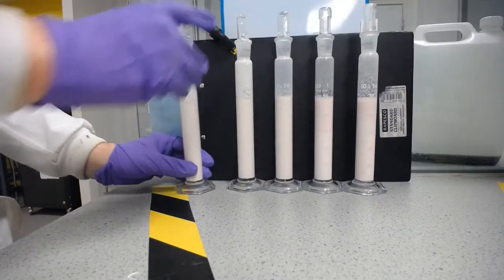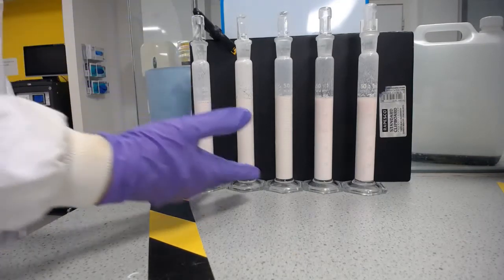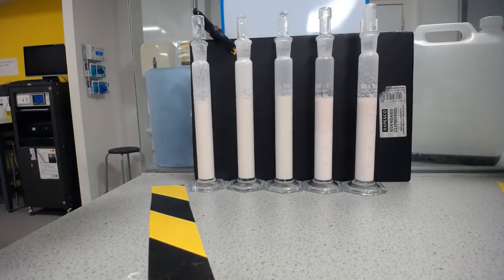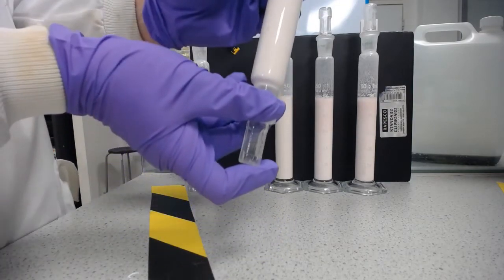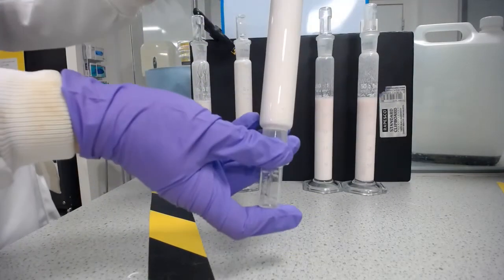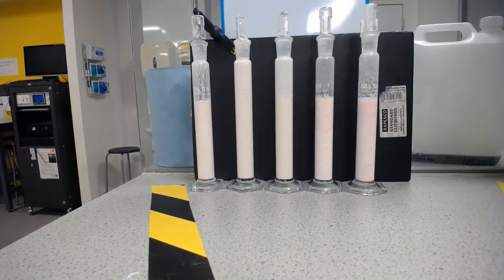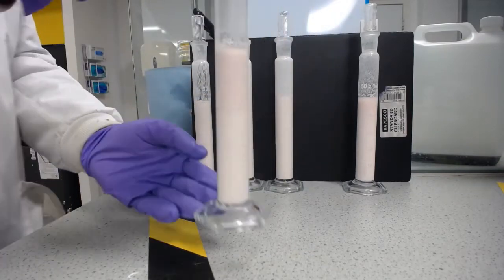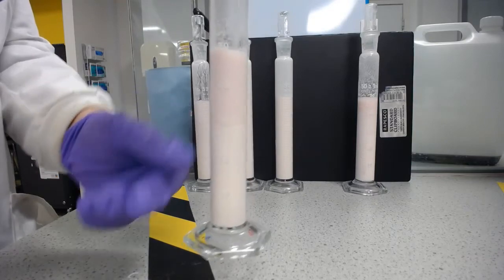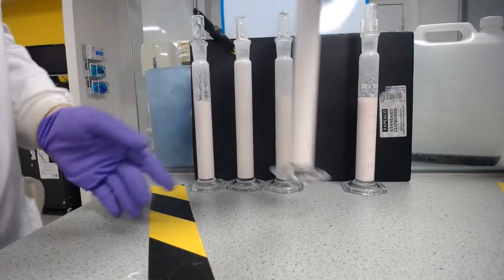And I would say that was actually after just one inversion. One. These two, they're already fine. We'll double check that. There's no sedimentation. They require 0 inversions. Now, after a day or so, they probably would require some inversions because it's not going to be stable forever. And D, we can see we've got formulation split there. And again, just one inversion required.